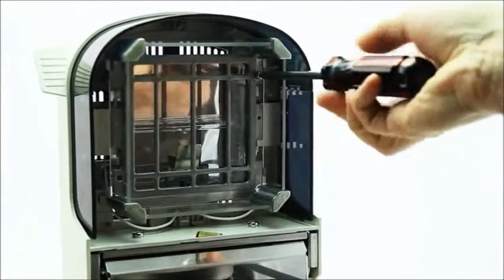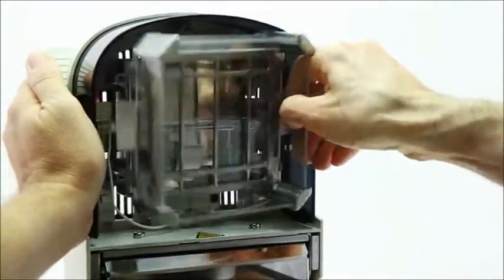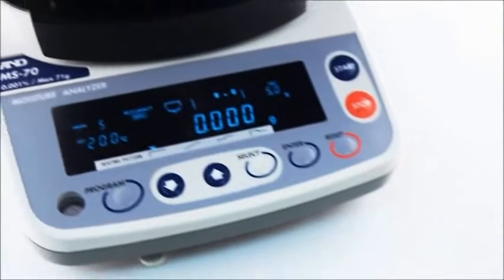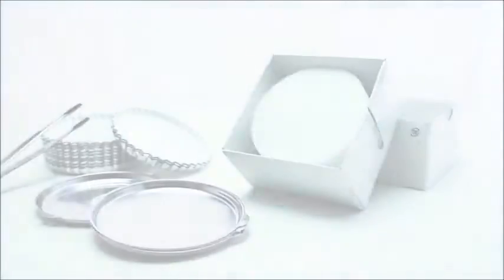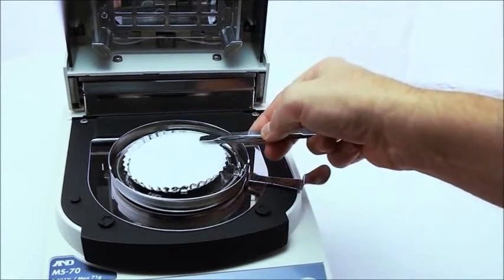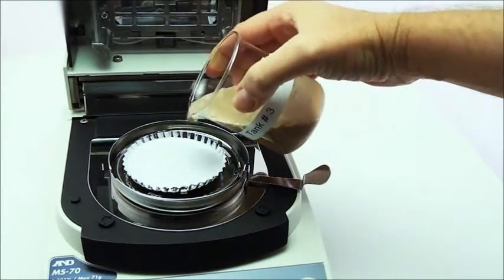The halogen bulb offers a long life of 5,000 hours and is simple to replace. The bright display offers easy viewing whether it's in the laboratory or on the production floor. Standard accessories add extra convenience — with the included glass fiber sheets, even difficult substances such as colloids and high water content compounds are reliably measured.